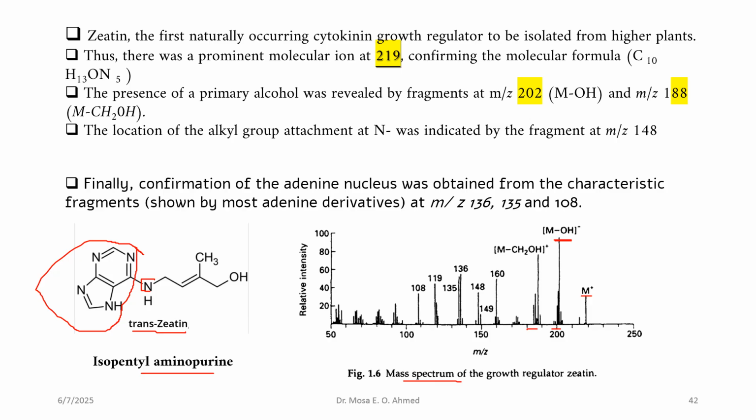Also, the position or mass-to-charge ratio at 148 indicates an alkyl group attached to N atoms. Okay.